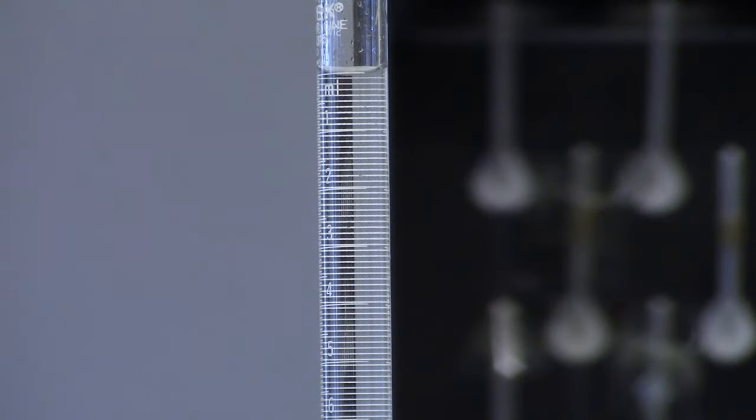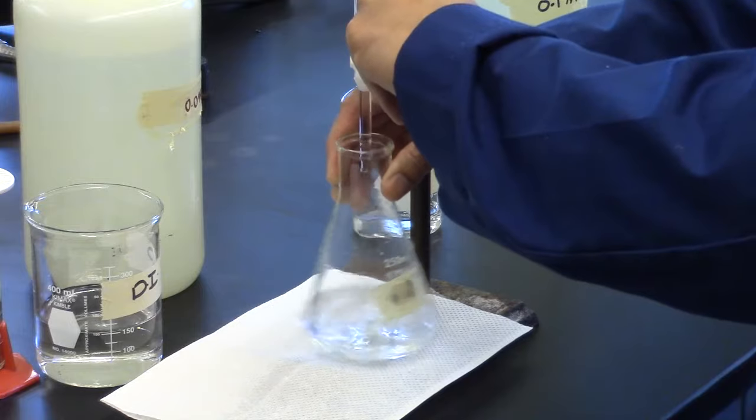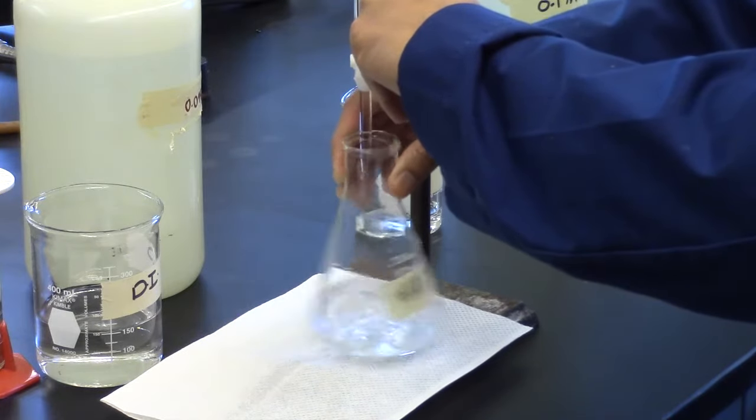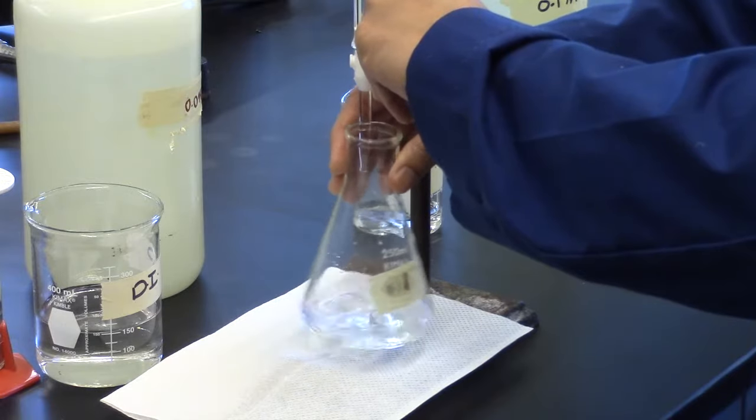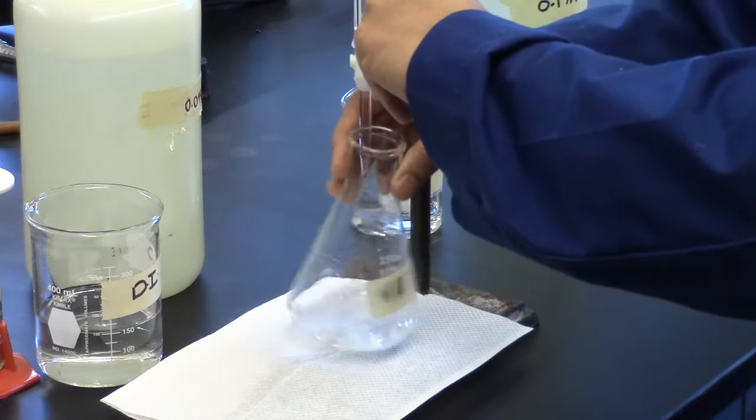Record initial burette reading and add sodium hydroxide solution in a controlling manner. Place the flask containing the indicator and sulfamic acid on a white sheet of paper or paper towel to make the endpoint easier to see.